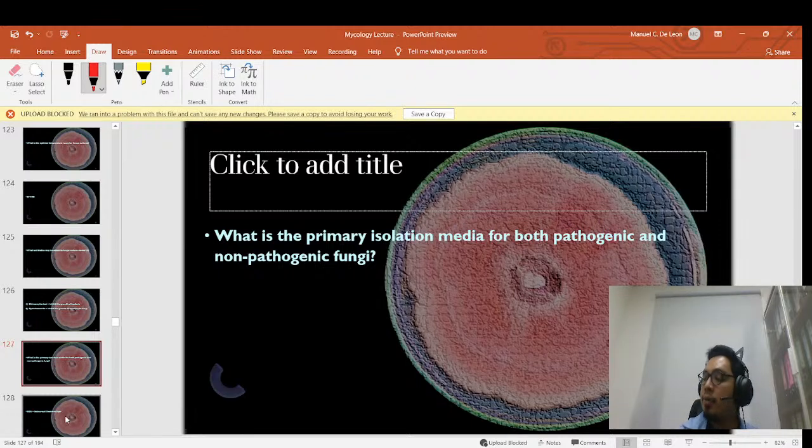For us, since we don't have enough manpower to hire another person to make the culture media, nor the infrastructure to create a sterile environment for manufacturing it, we opted to use commercially branded media such as this one. You would know it's commercially branded if there is a lot number and expiration date, as well as the name of the company on the agar. Again, I'm not advertising the culture media, hence I didn't tell the name of the manufacturer.